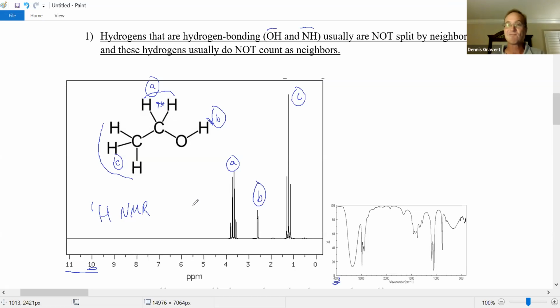So here's a case where the tendency is that farther downfield should be closer to more electronegative atoms or pi bonds. Not always, but integration is much more reliable. Also, the splitting pattern is quite reliable too. However, there's an exception here. Let's talk about peak C.